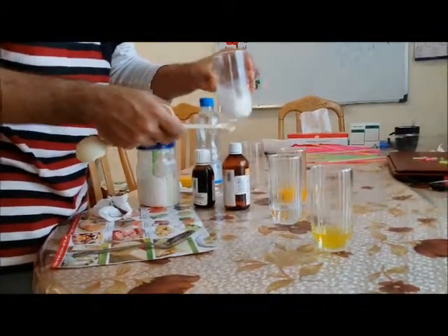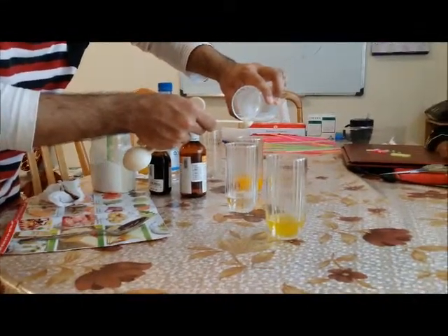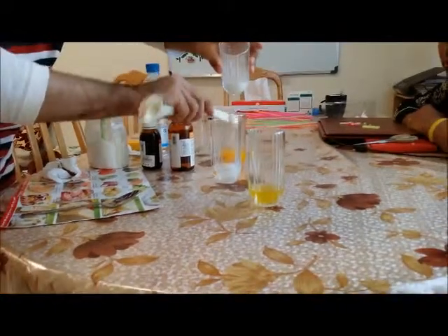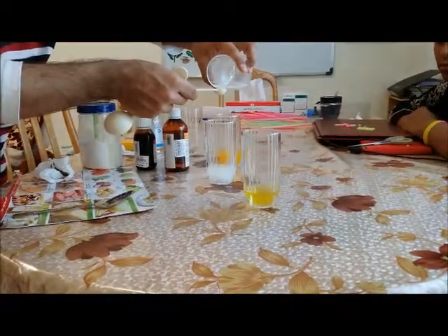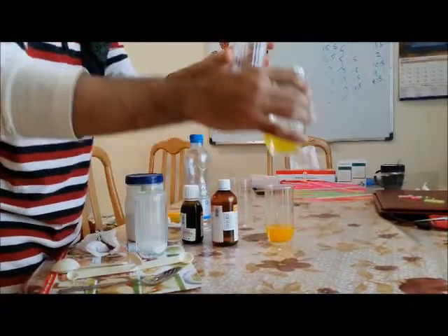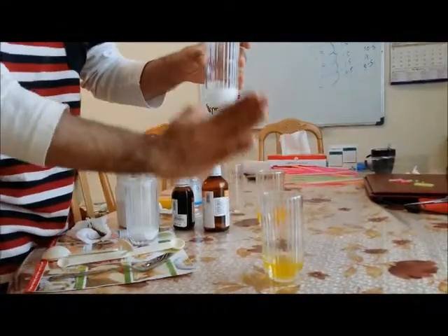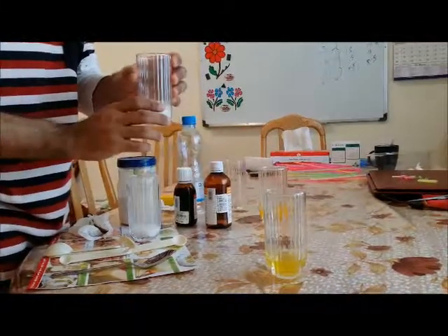Give a nice shake to it. Looks cloudy clear. Now is the time to join your B and A together by shaking it about two to three times and leaving it for a minute.